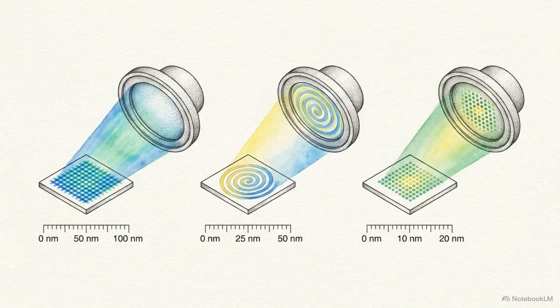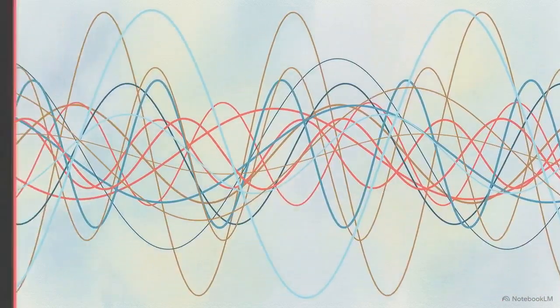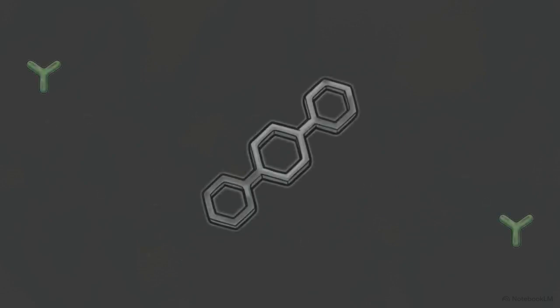We break the diffraction limit using 3 primary techniques: structured illumination, stimulated emission depletion, and single-molecule localization microscopy. Single-molecule localization, which includes methods like STORM and PAINT, solves the blurry ensemble problem created by overlapping light waves. To isolate individual fluorophores from the blur, these methods deploy photo-switchable probes or reversible binding dyes.